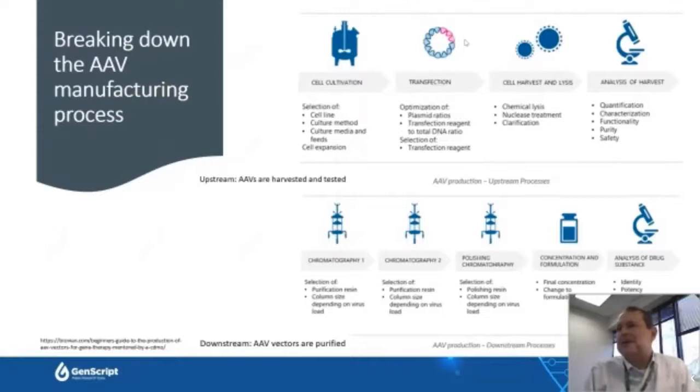There's a polishing step where we remove debris, and then we do aseptic fill into the production and the dose packaging. And then we are using several analytical methods that are prescribed in the guidances from FDA to make sure that we understand what is in the dose. Any residual material is being analyzed, as well as what type of DNA and if the capsids are formed.